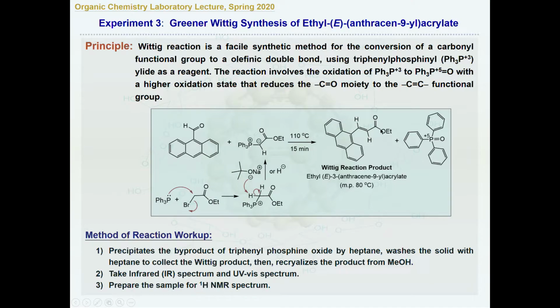Besides that, it will also have the CO vibration and the COC vibration. All these focus around the region of 1100 to 1200 wave number. So you should have two multiple peaks in here, the CO being one and the COC the other. In this 1100 to 1200 wave number region, you should see those peaks. Of course, the CC double bond will be at 1600 wave number, but it will mix with the aromatic, so we may not be able to differentiate on that. And that's the main IR differentiation.